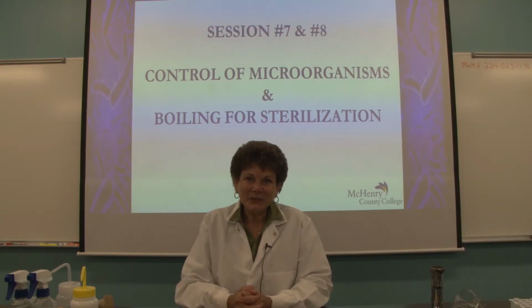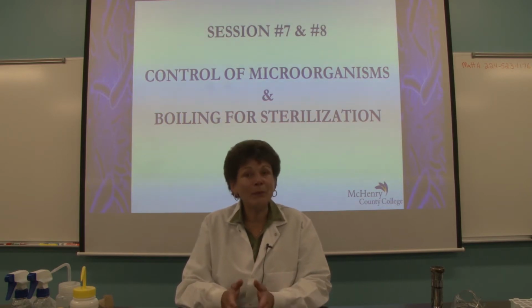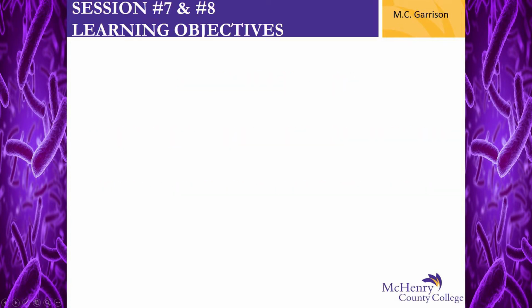Welcome back to Bio 255 Microbiology Laboratory. Today we are going to combine both Session 7 and Session 8 setups, and then we will read their results together as well. Session 7 is entitled Control of Microorganisms. Session 8 is Boiling for Sterilization. But before we begin, let's take a look at our learning objectives.